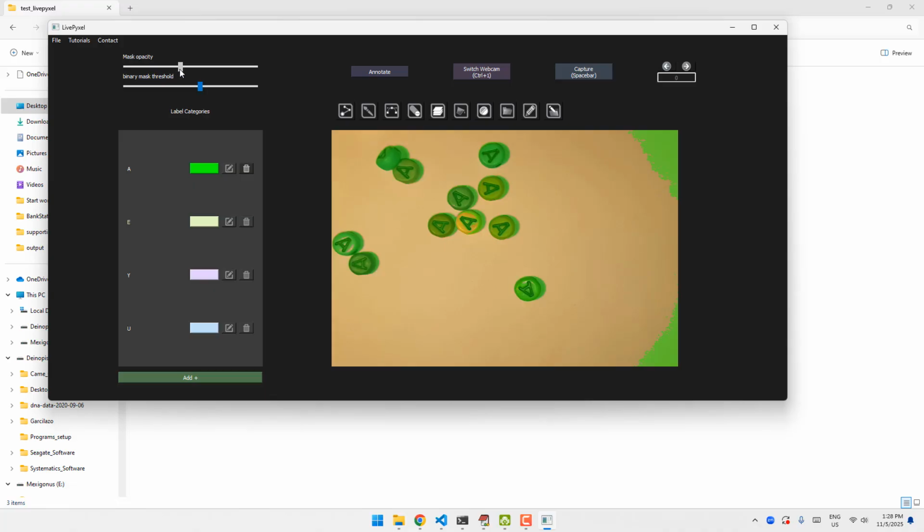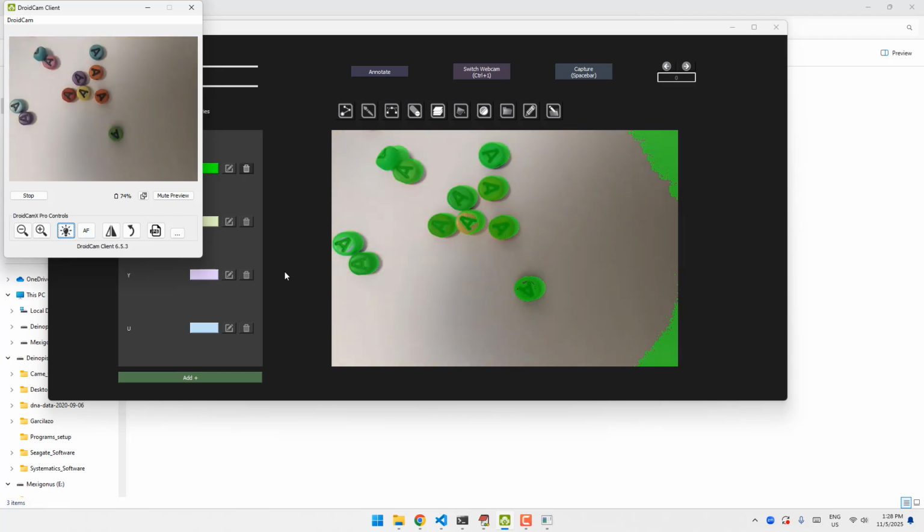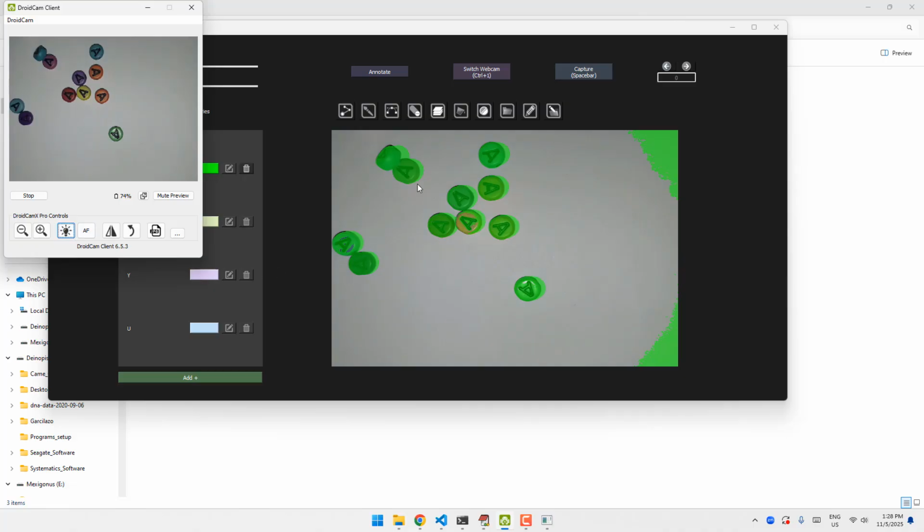And the best strategy for that is to change the light source to something that is more directly above. This is part of the setup of your environment. That is to be expected whenever you are working in highly controlled environments. Let's turn on the flash so that the light appears directly from above.